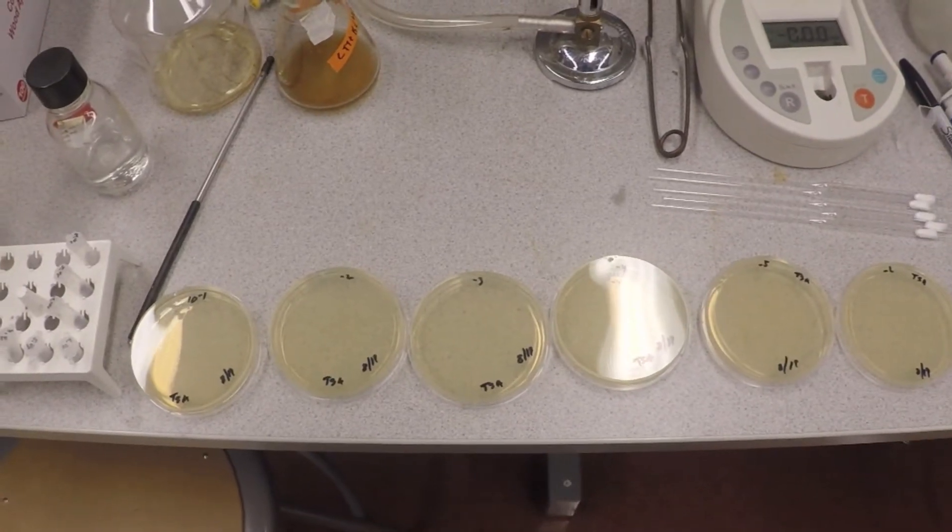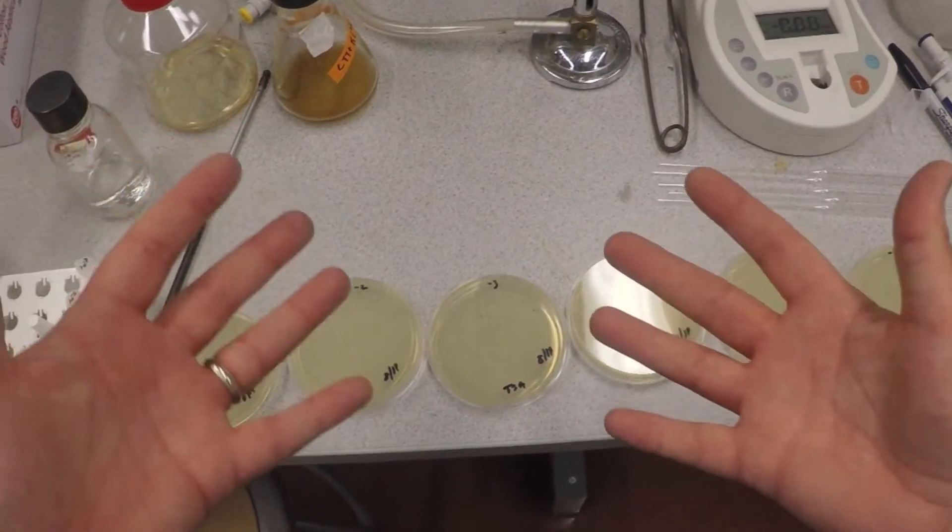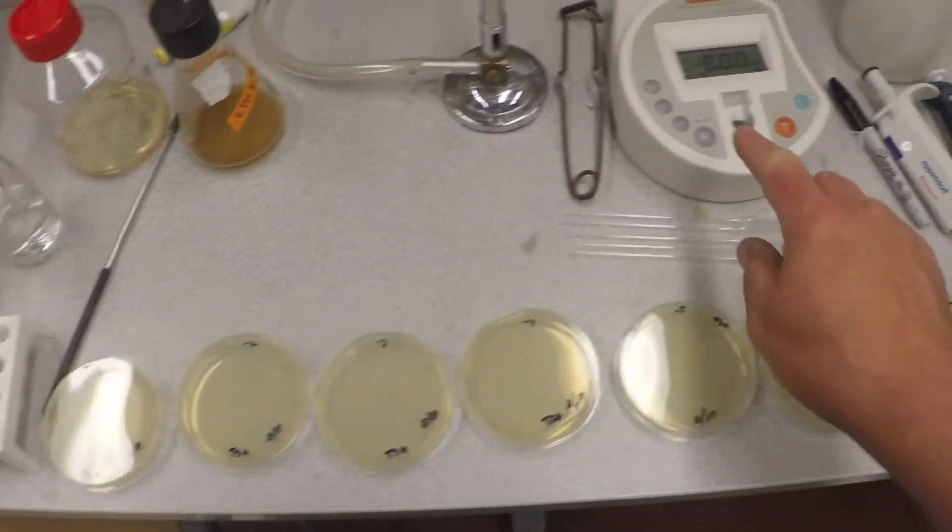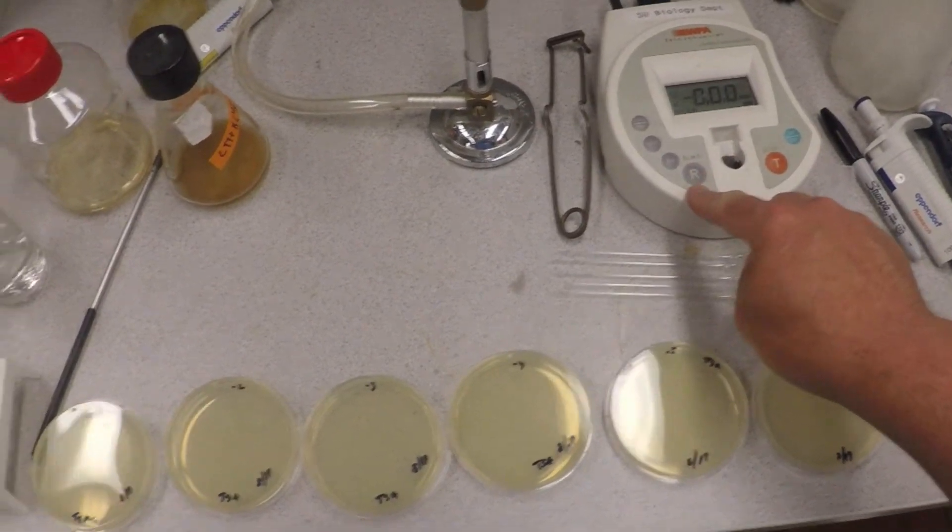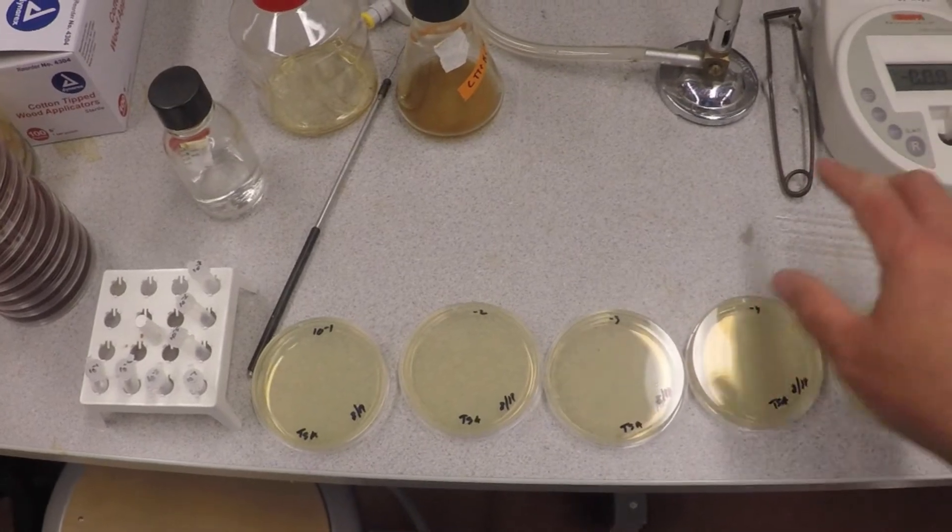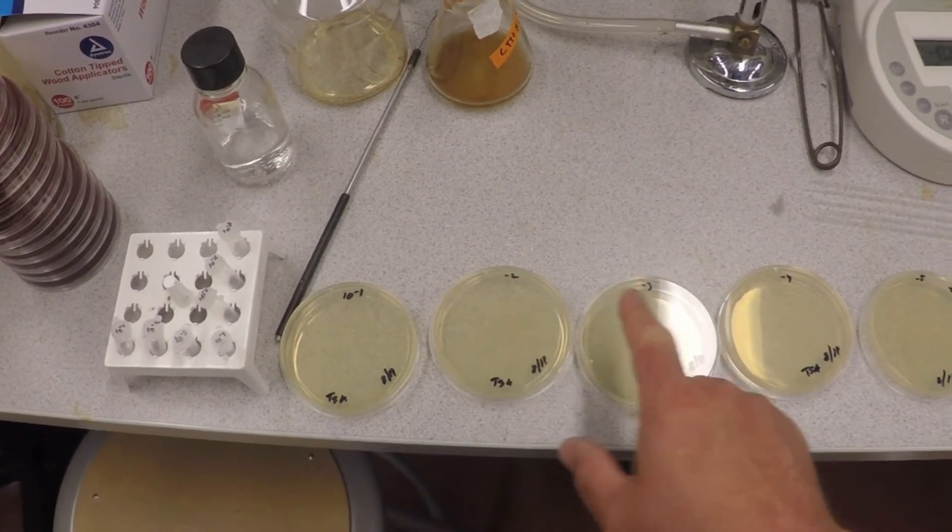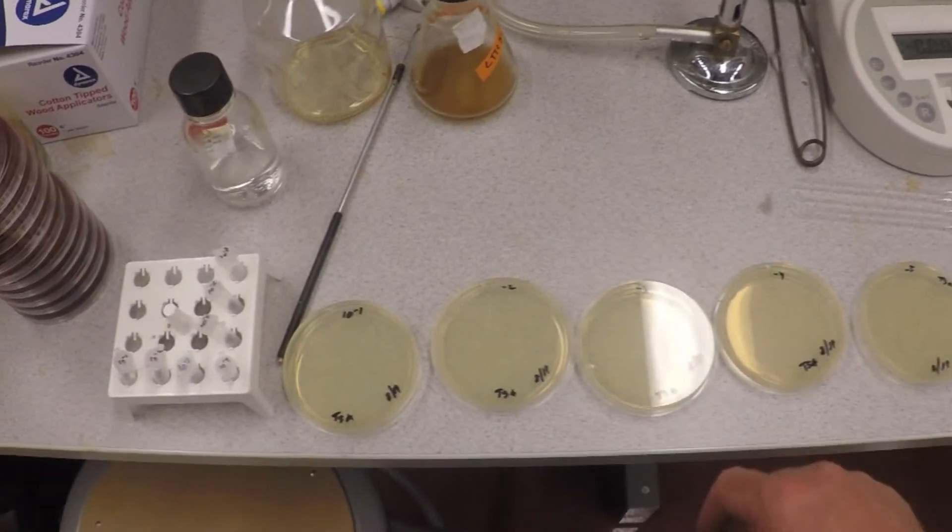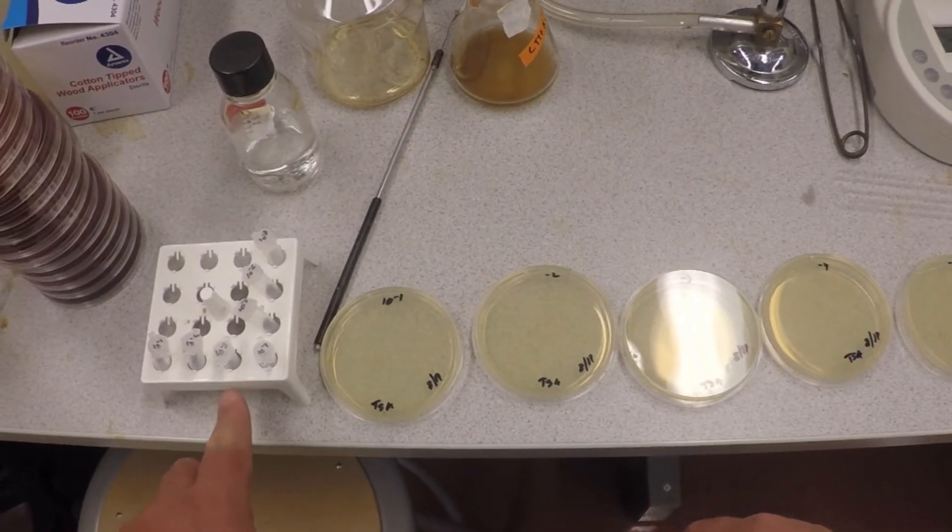Now we're going to show you how to do some basics on quantifying bacteria. There's a couple ways we're going to do it. We're going to use a spectrophotometer and we're going to take the sample and make serial dilutions and plate them out onto serial diluted plates and show you how to make dilutions for those.